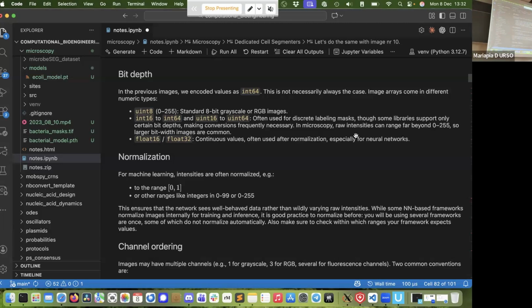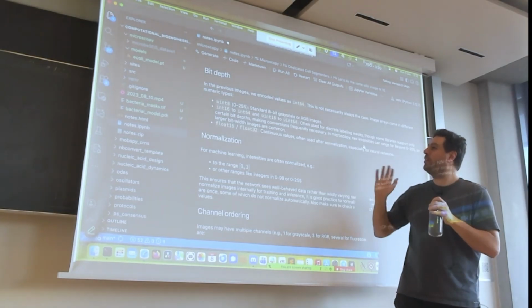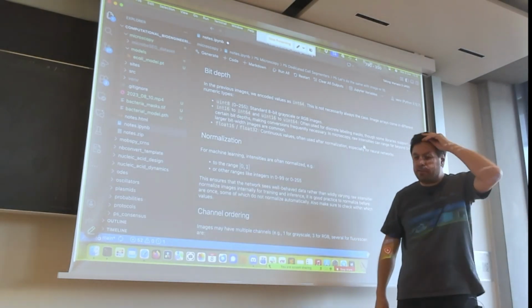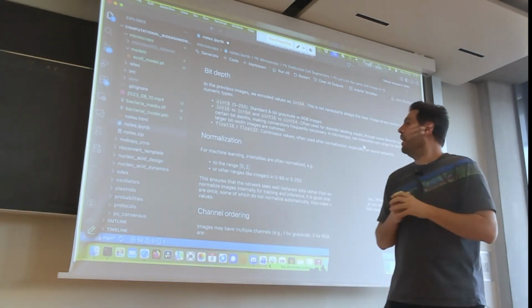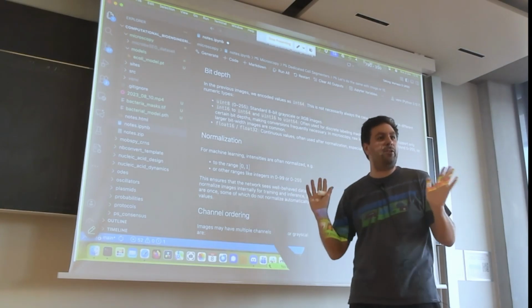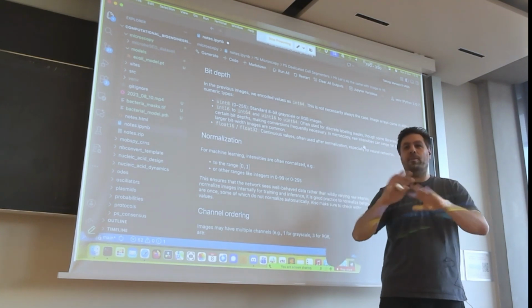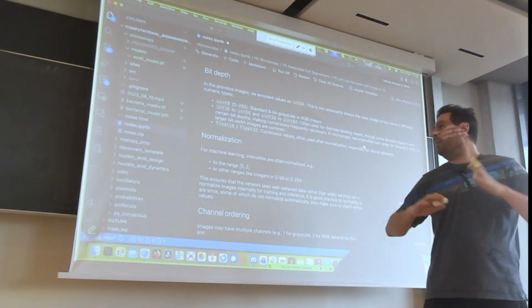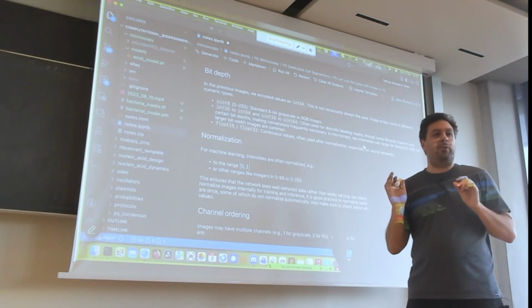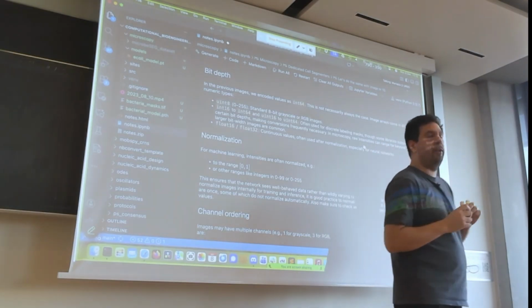Your training might go completely wrong. Your images might show completely black and nothing, and so on. It's a painful source of errors. So always check your bit depth and what you're doing here, what's expected. What is particular about it is, as we show you in this course, your image chain of course has many software components from authors that are not at all related. So something might need this bit width and the next one that. There is a lot of transforming images between the different stages, and these are typical errors. So perhaps the general rule is to always sit in between the stages and check. You will see in our code that we put a lot of assertions for the dimensionality and so on, and this is exactly for such reasons.